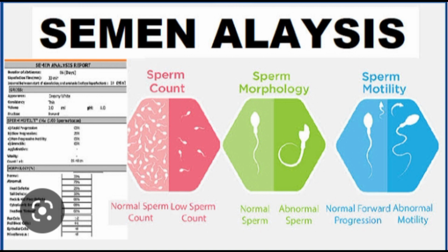Total spermatozoa count. The counting of spermatozoa is made in the same manner as WBC is counted using a WBC hemocytometer pipette except for the diluting fluid. The semen is drawn up to the 0.5 mark and semen diluting fluid is drawn up to the 11 mark. The total count of spermatozoa and the calculation is done as in the case of leukocytes.